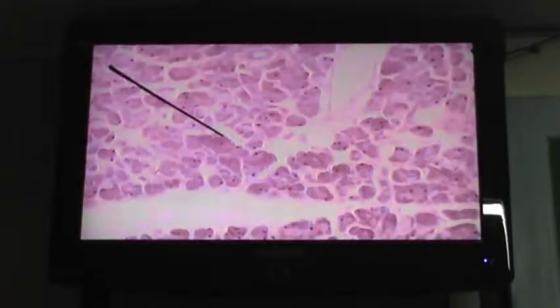Focus ko. Pa-picture ko na focus ko. Sundan ko mo. Wala ko ma-focus.